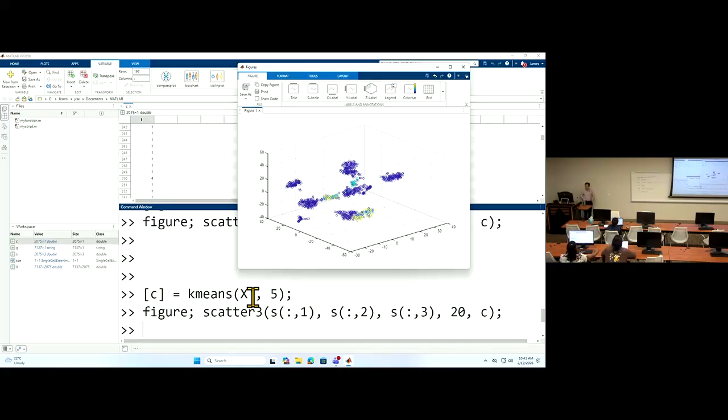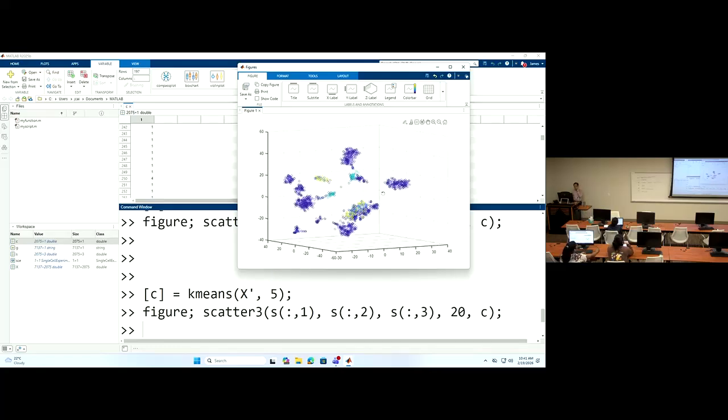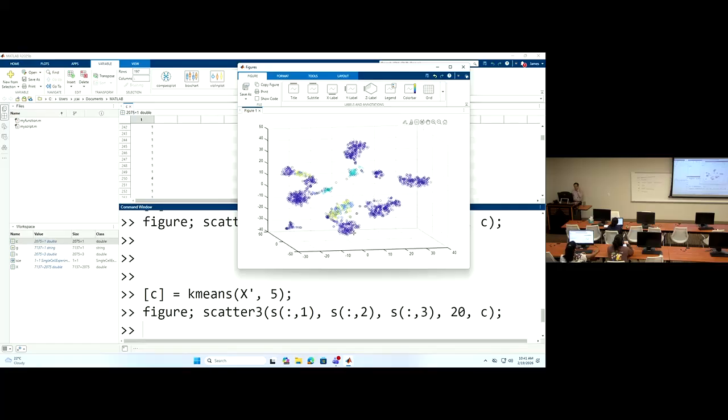There is some distance computation which is not so accurate. Remember, k-means is based on the distance between the data points. They are not a good separation, while in the embedding all the blue cells have been grouped together closely.